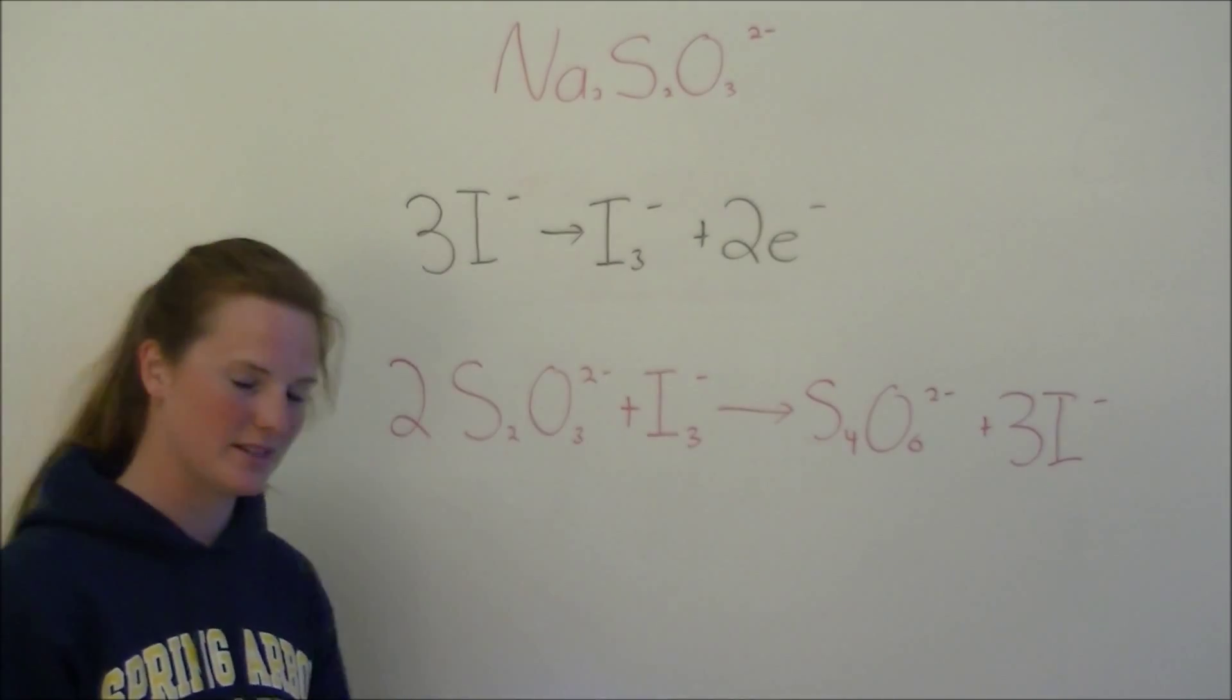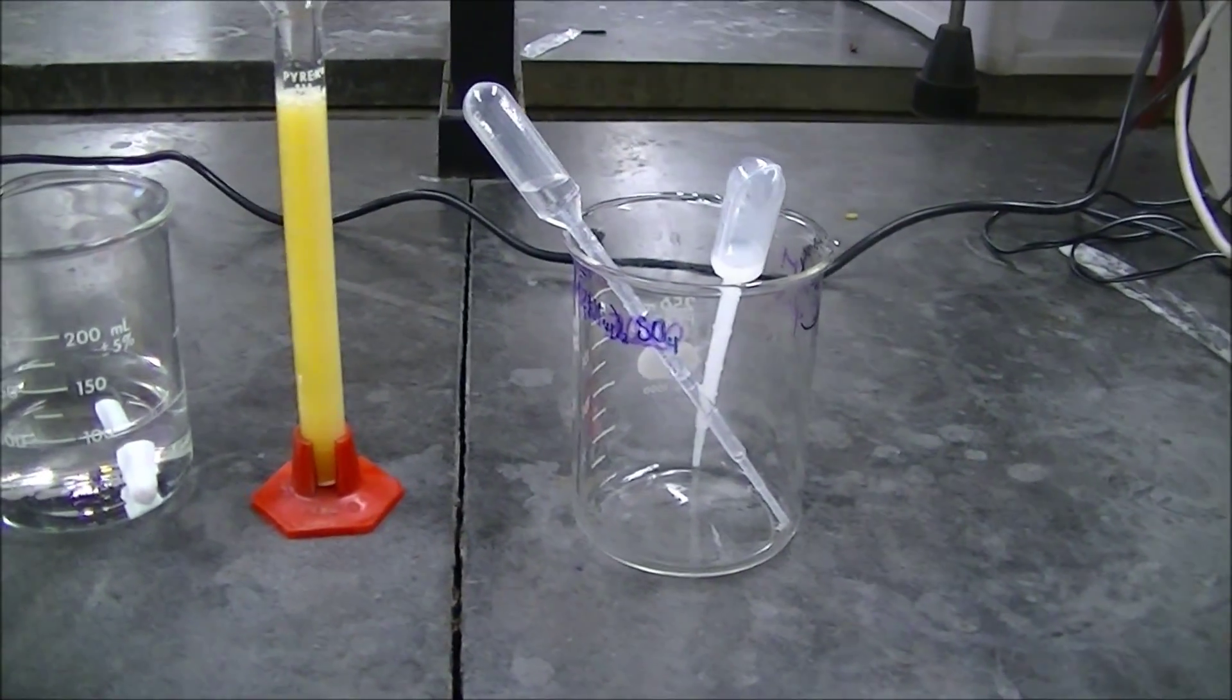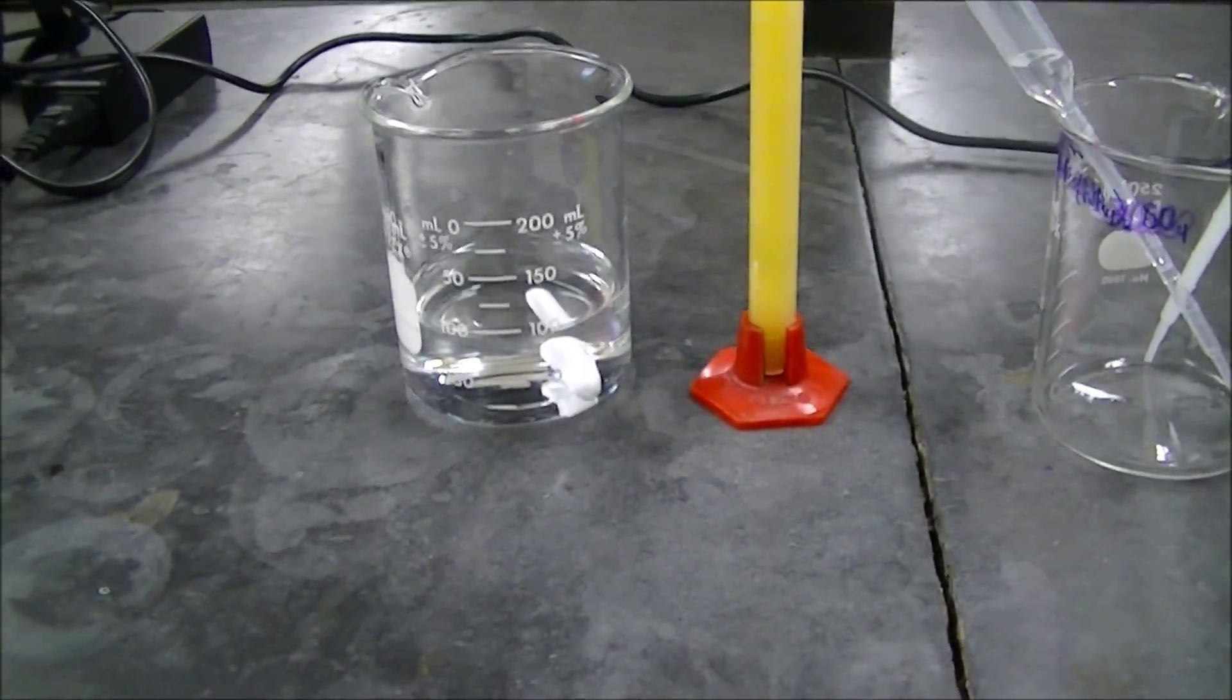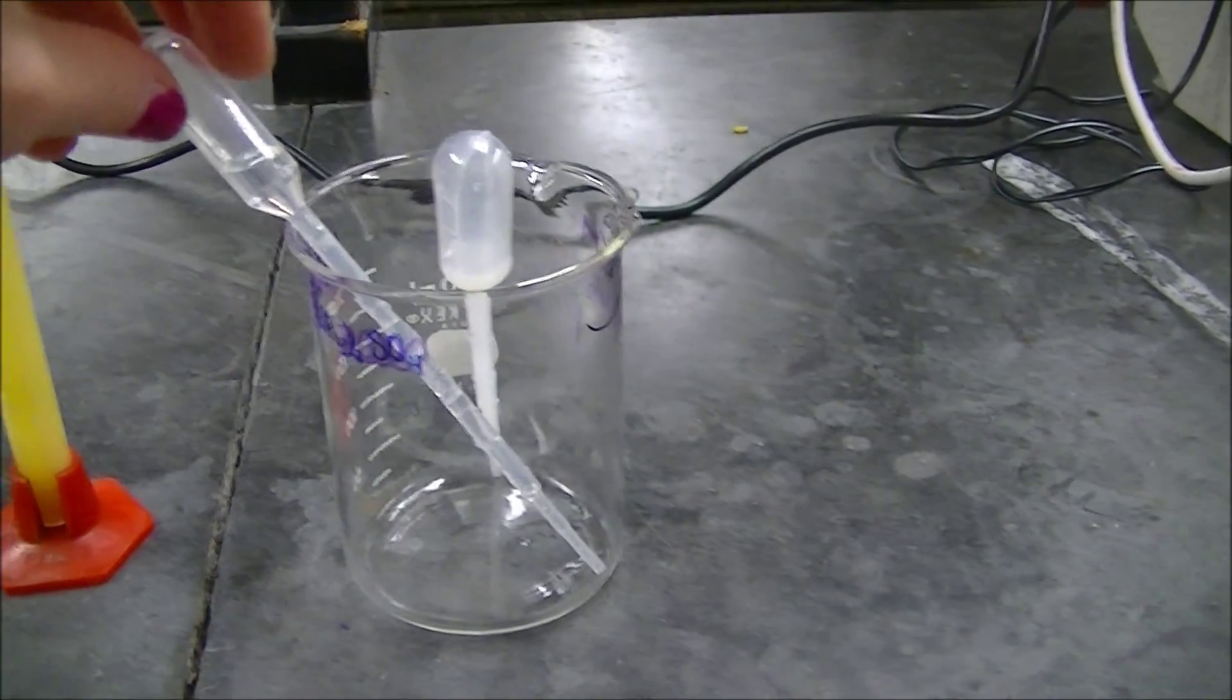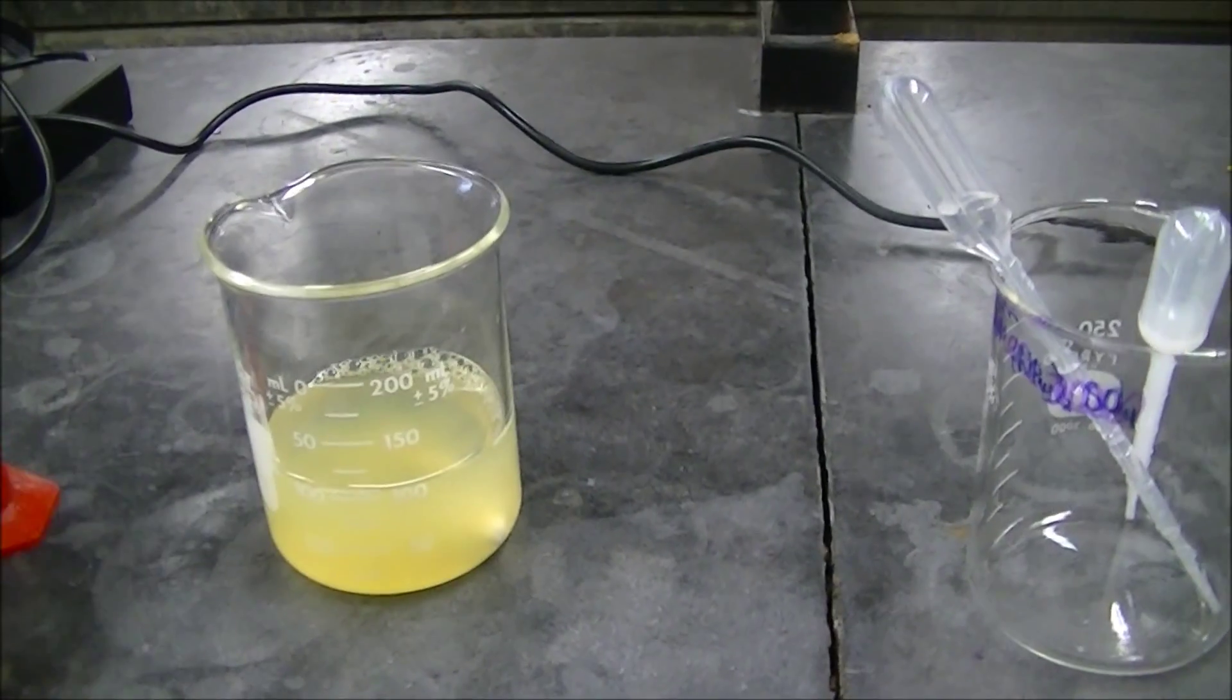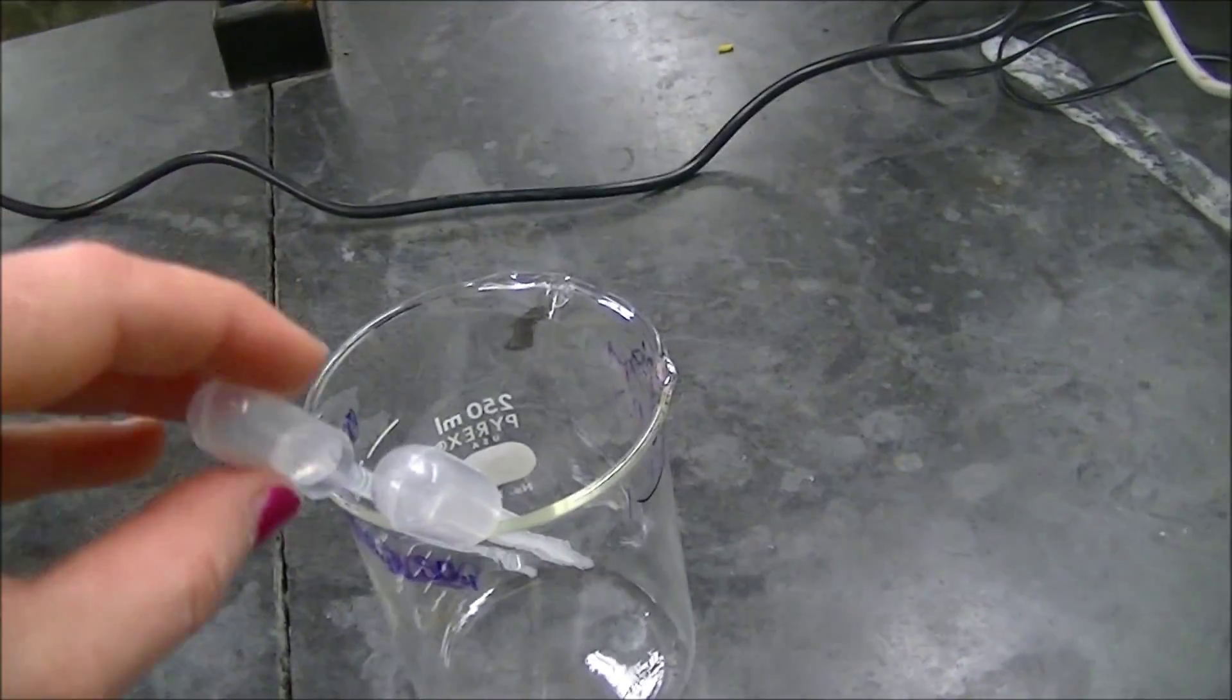Now that you have background information, I'm going to show you the procedure and the setup that's involved in this experiment. Here we have all our materials that we're going to use and put in our solution. First, we have our 0.1 molar potassium iodide. We already have the stir bar in here, and we have 80 milliliters of this. Next, we have our orange juice which is going to provide our ascorbic acid. Then we have some phosphoric acid in this eye dropper and some liquid starch in this. We're going to pour it all together. Orange juice, 10 milliliters of that. Then we're going to do seven drops of both phosphoric acid and seven drops of the liquid starch.